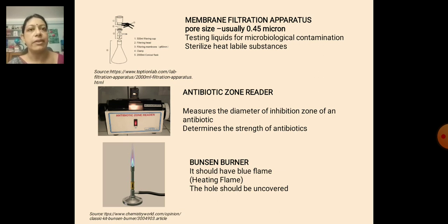If there is microbial growth, that means the liquid or the preparation has microorganisms in it.